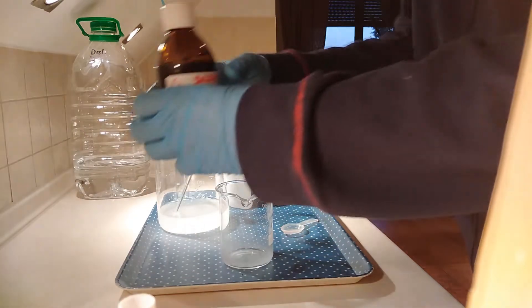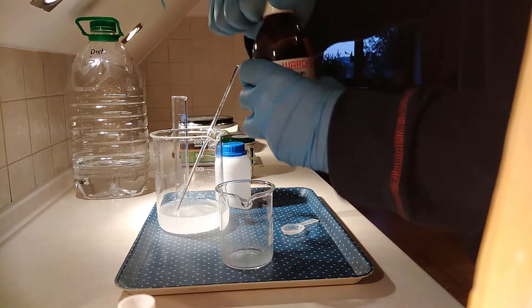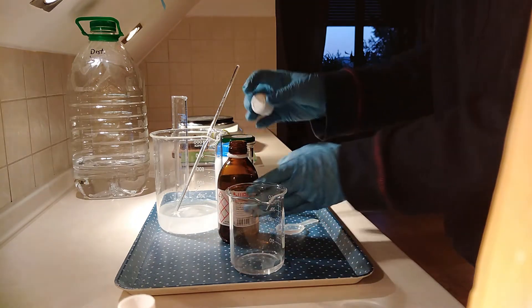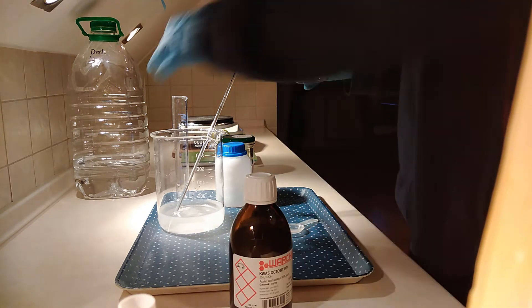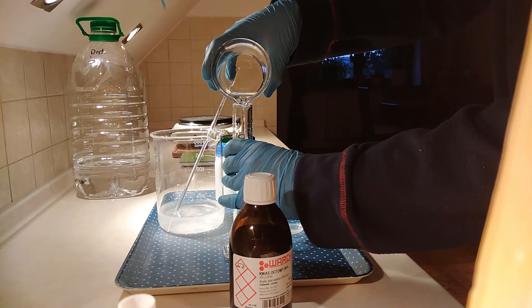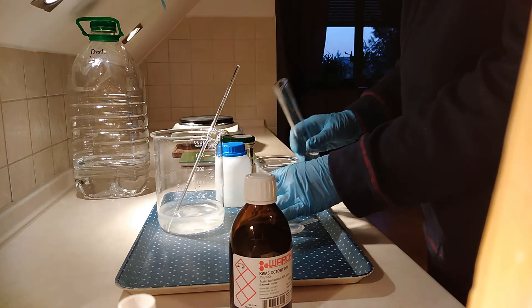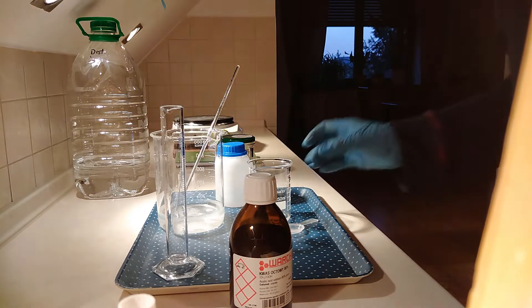Now the concentrated vinegar — as I like to call it, the acetic acid. It smells horribly because it's well, vinegar, but a lot more concentrated. So here we have it. How much of it do we have? Let's check using a graduated cylinder. Around slightly above ten milliliters — so not a lot. And we don't want a lot.